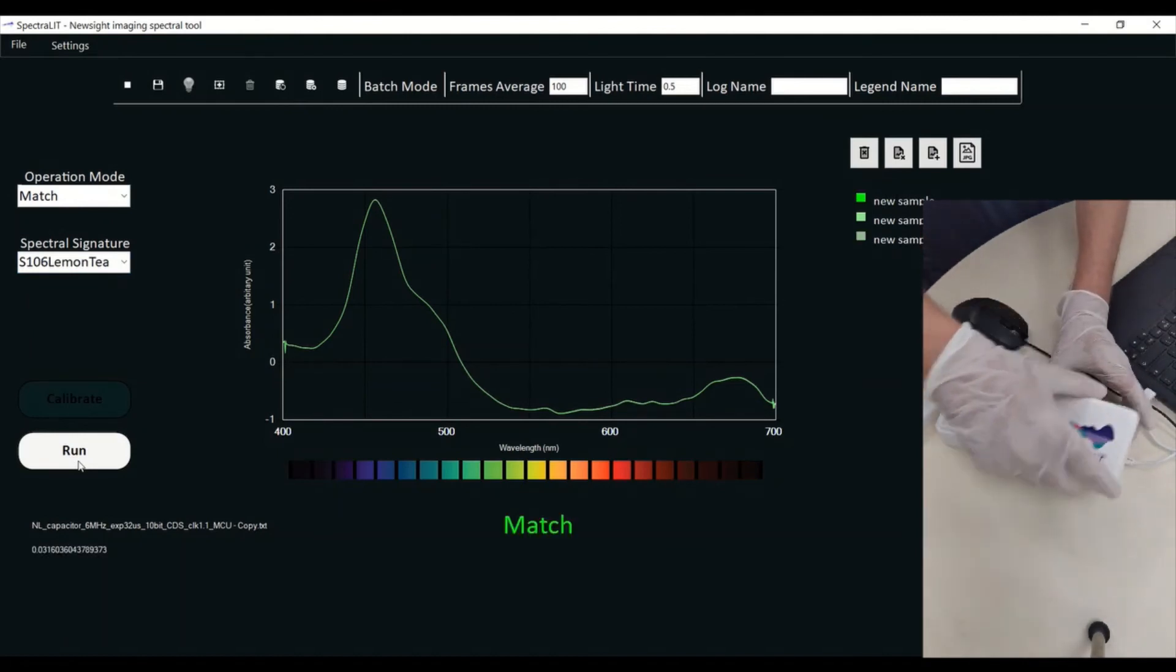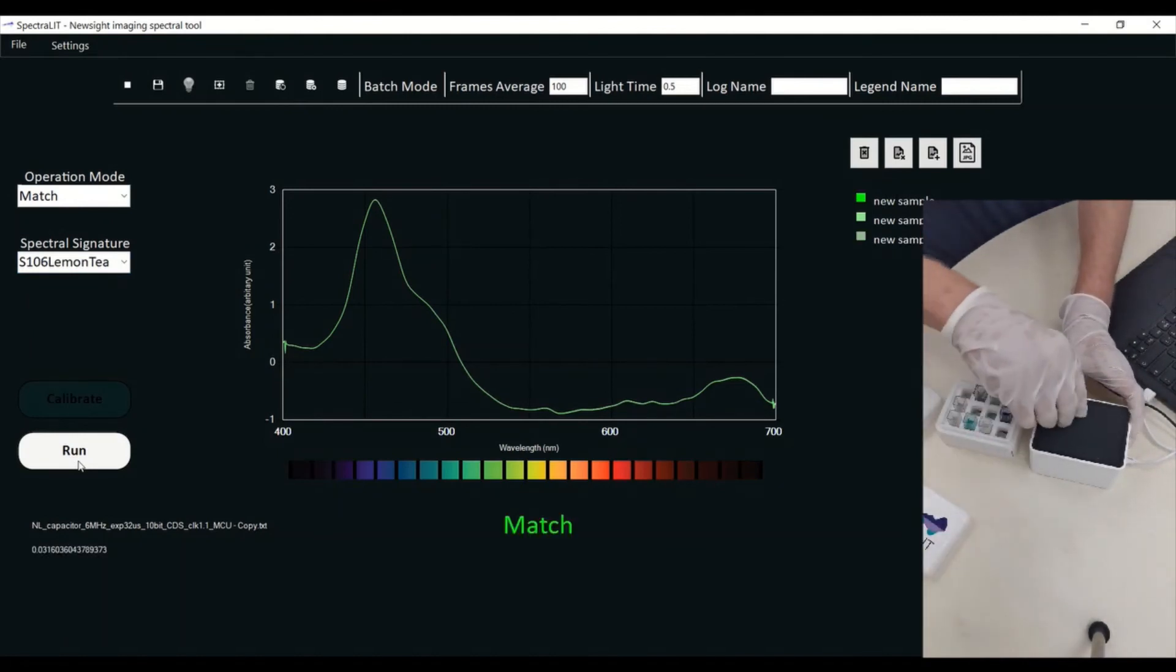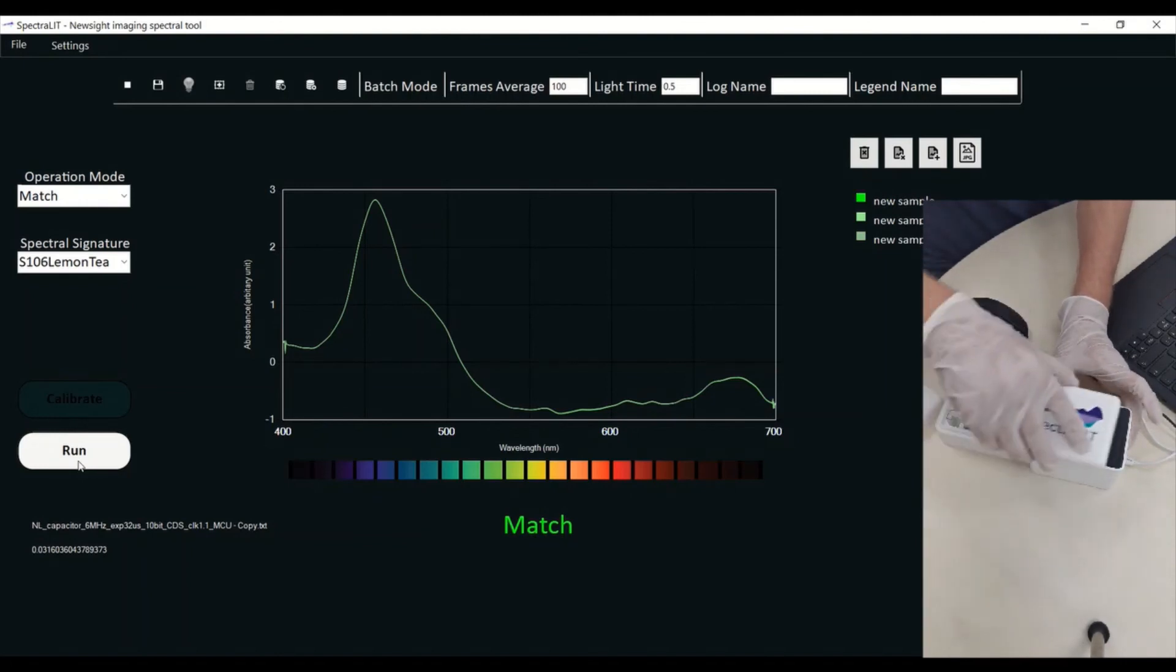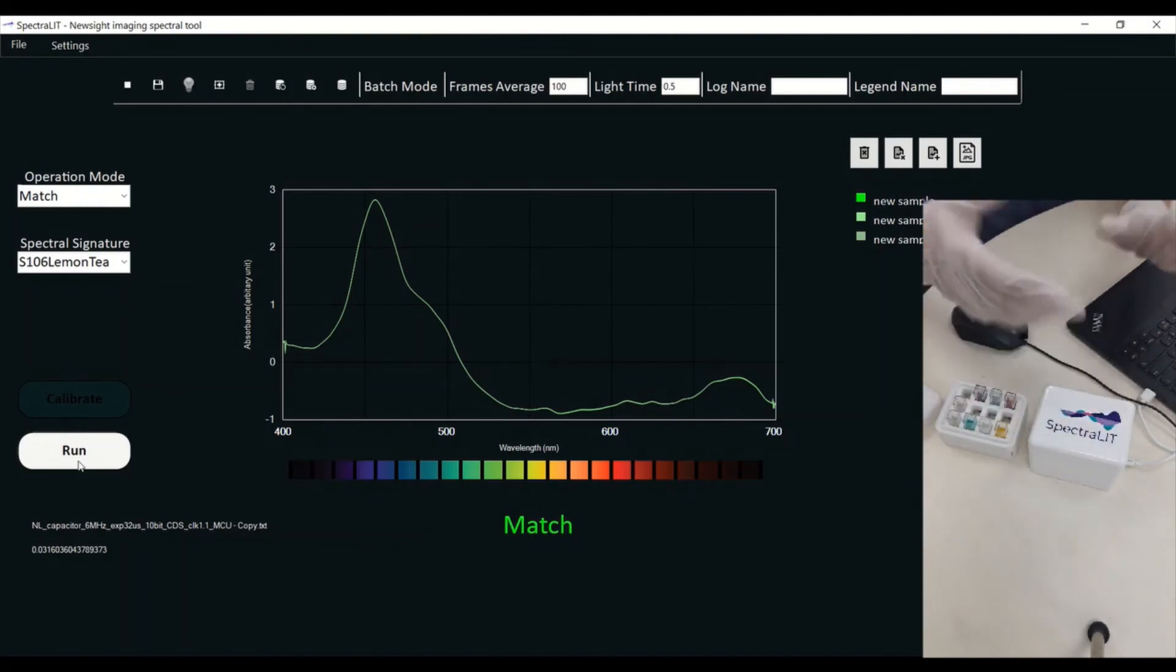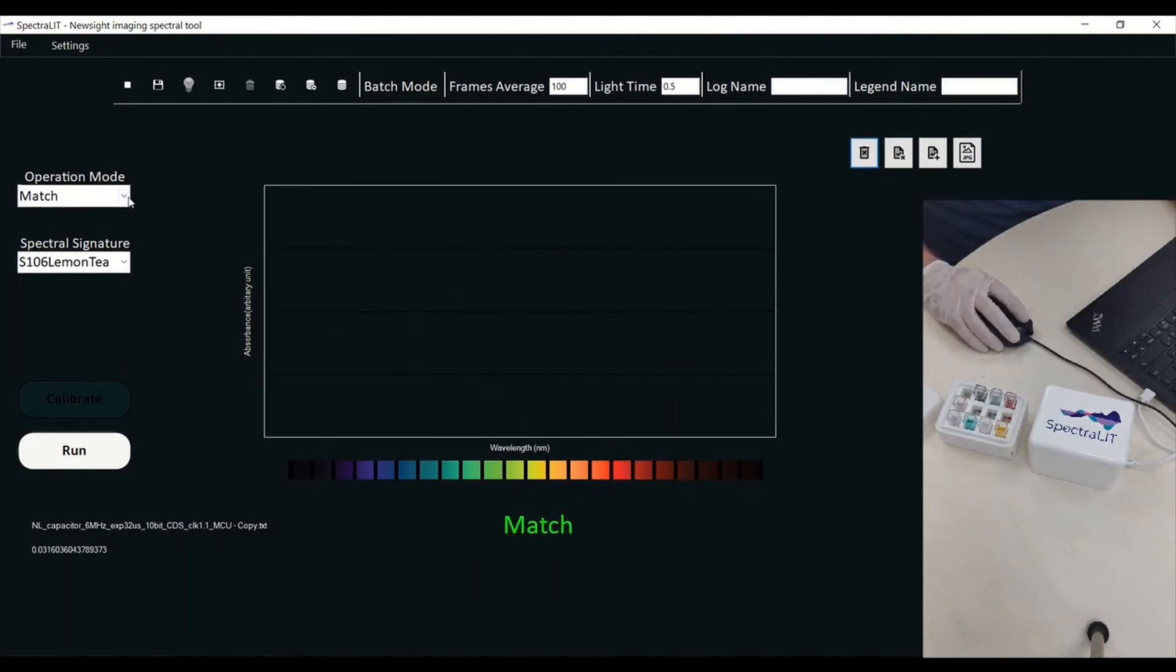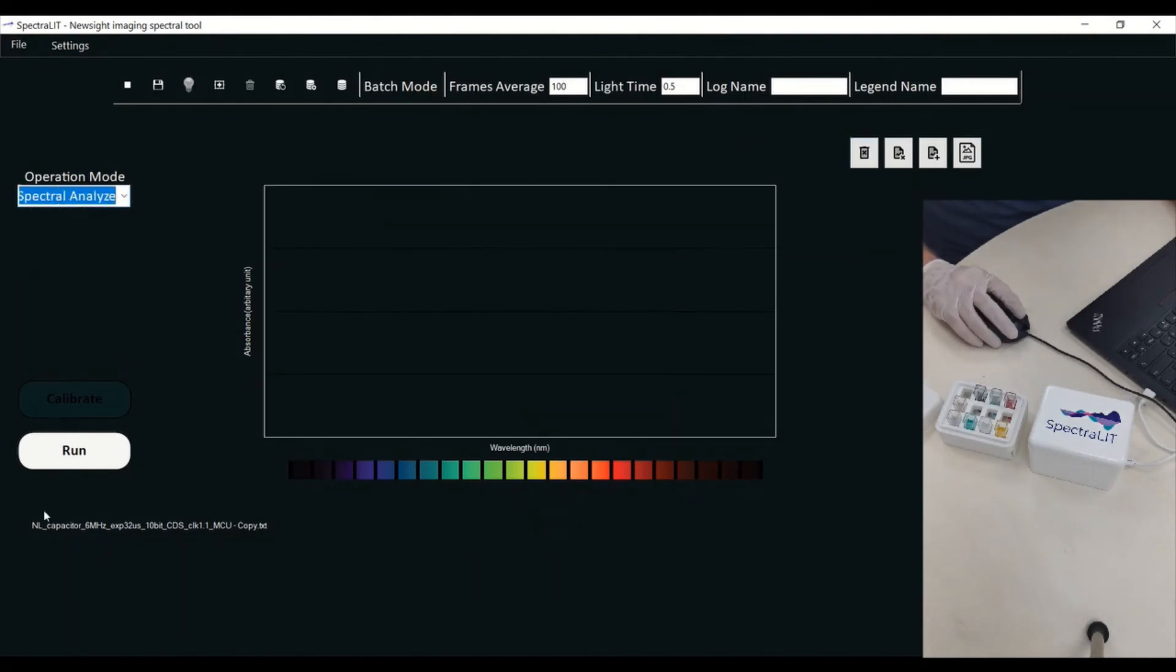Of course, I can put other substances. It's interesting to see what happens if I'm putting a blue substance. I'm going to do a spectral analysis of this substance.